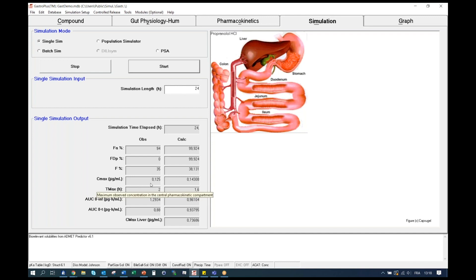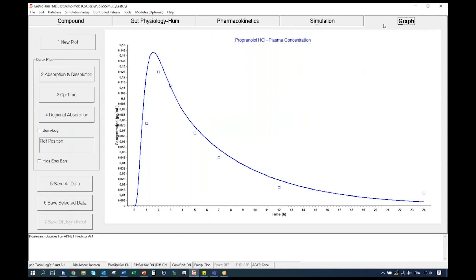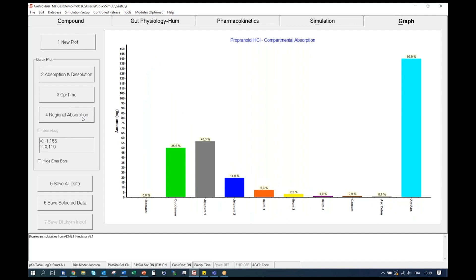You can see that the model is calculating PK metrics for both the observed and simulated profile here at the bottom. Here you have the calculated Cmax for both observed and simulated, AUC, and so on. Now let's have a look at the result of our simulation in the last tab called Graph. First, you can see that the simulated profile — the line — is matching fairly well the observed data in this case. By clicking on the regional absorption button, you can see where the drug is being absorbed in the GI tract and the total amount being absorbed. On the left, you can see that almost 100% of the drug is being absorbed.